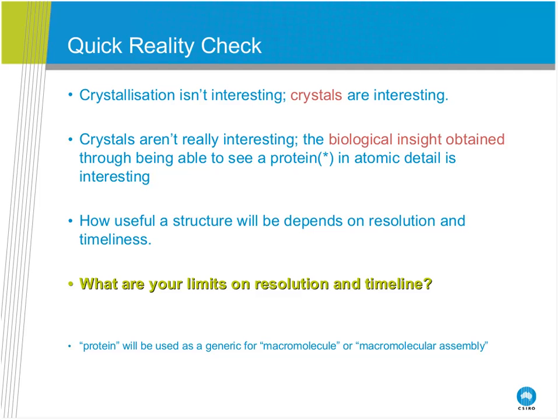And so one of the things that we always have to be aware of is that crystallization isn't an endpoint. Crystallization is a sort of irritating necessity on the path to an endpoint. And that also then brings up this idea of the relevance of the information that you're getting. The relevance of the information will depend on the time in which you can get that information, but also on the resolution of the information that you get.